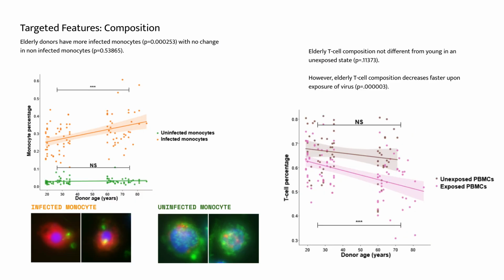As just one part of our aging profile, the compositional features I described showed significant differences between young and old.